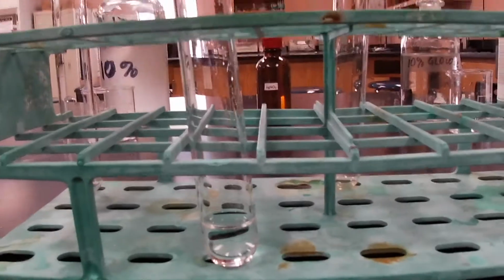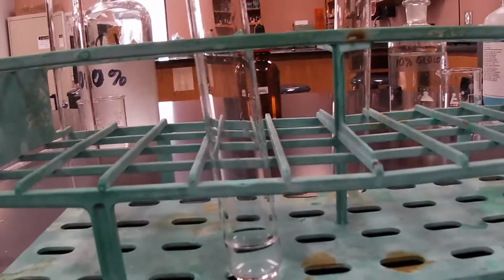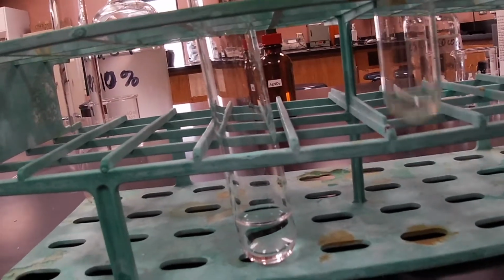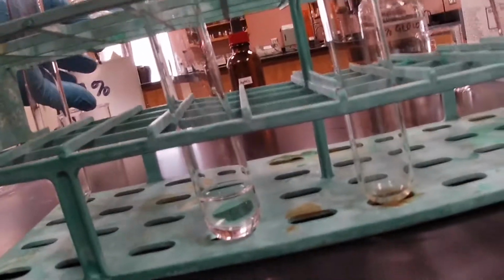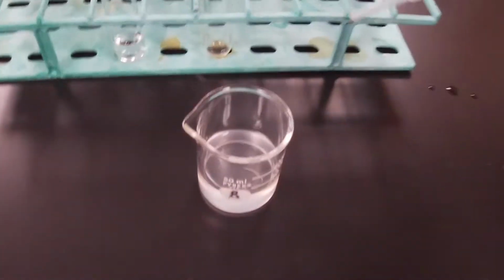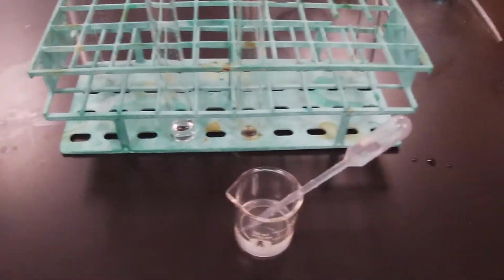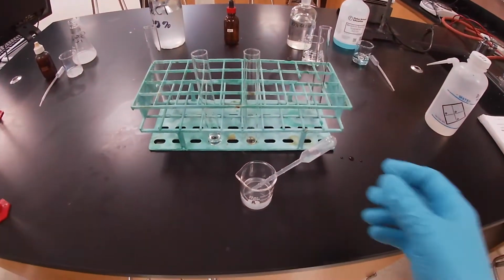The first test that we're going to do is we're going to get sodium chloride. So this will be the first test, and it'll be our sodium chloride test. So we're going to get some salt water, in other words. And here we have a pipette. And let me go ahead and zoom out, sorry.